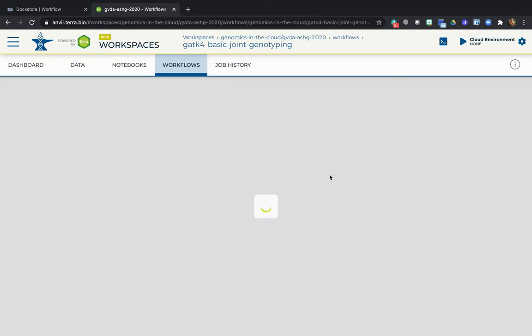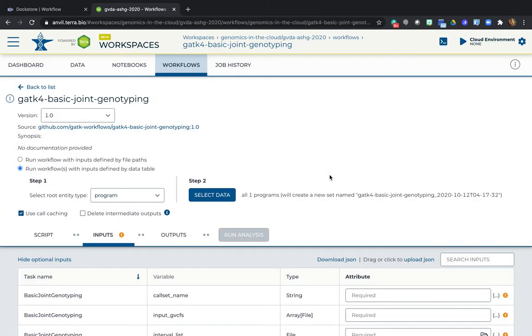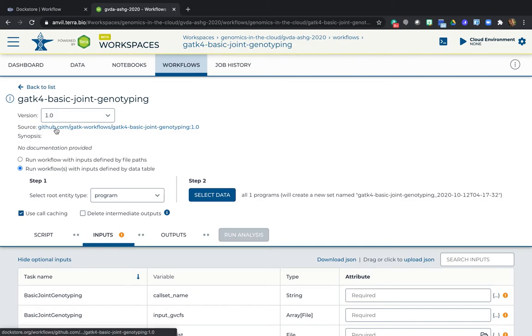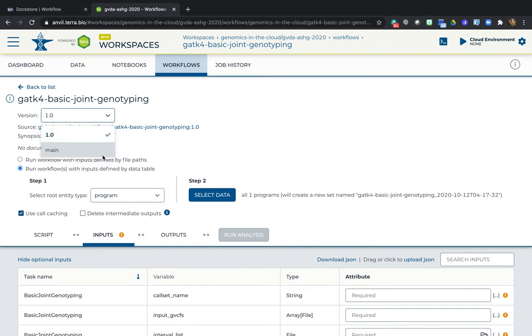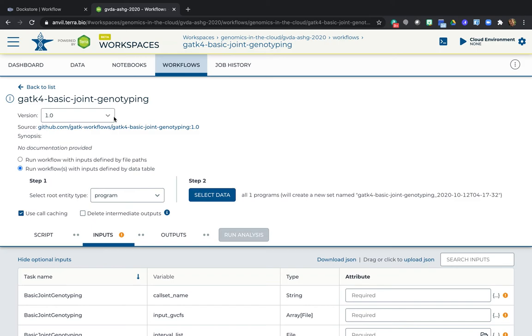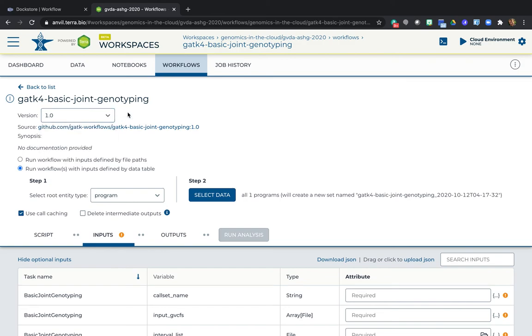And there it is. The workflow is now in my workspace with a link back to Dockstore. Now, even though it says GitHub right here, this is actually a Dockstore link. There's also a version toggle right here that allows you to switch the version if there's multiple versions of the same workflow. And what's really convenient is that when the workflow gets updated in GitHub and in Dockstore, you can update to the latest version directly from here. You don't need to go through the whole import process again, which is really convenient.